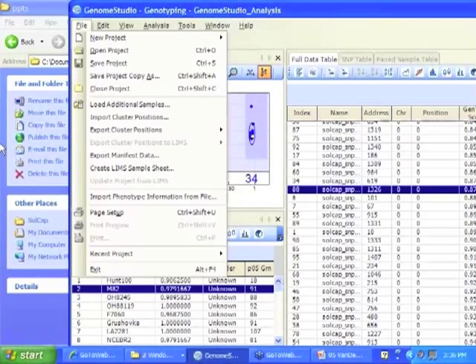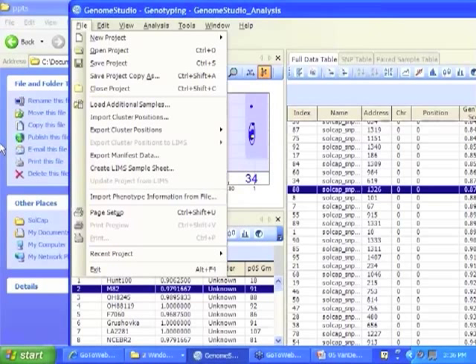And if you're using Illumina, if your lab is using Illumina, they will have access to the software automatically, otherwise Illumina charges you somewhere between $1,500 and $2,000 for the software. So it's not cheap, but it depends again how close you are to your lab and whether or not you can have direct access to it.